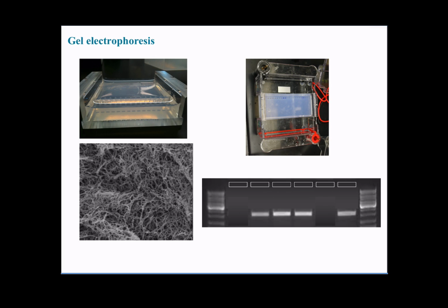So back to our original question, how can we use PCR to determine if a given sequence of interest is present in a sample or not? We subject that sample to a PCR reaction with primers that should detect that sequence of interest that we're chasing. And then we let the PCR reaction proceed, and we load those PCR reactions in these wells.